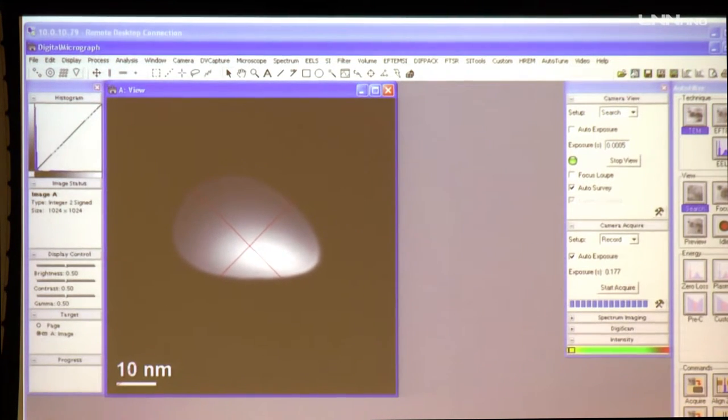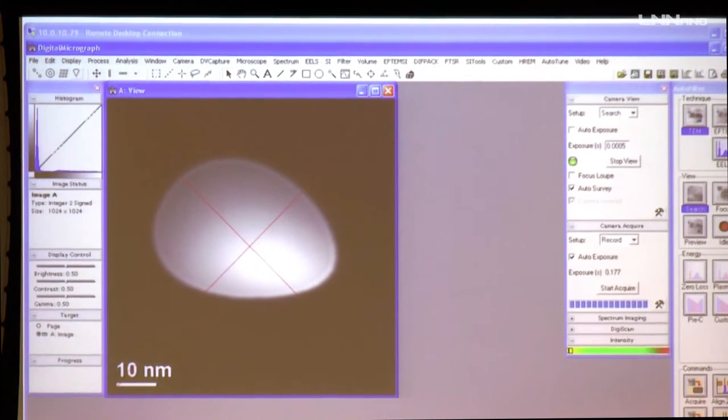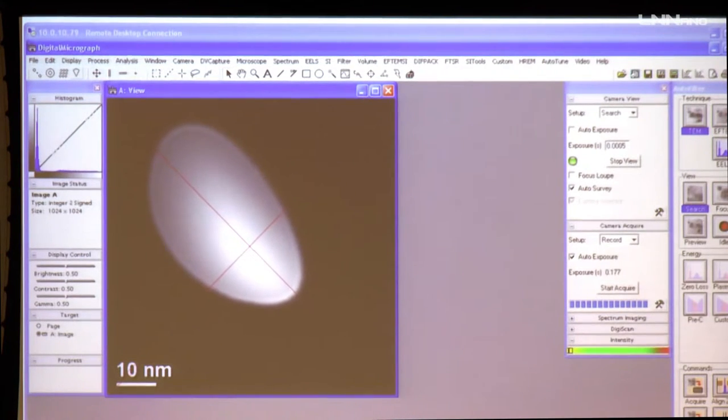So it's really very good. It's really a kind of equilateral triangle. I will try to show how an astigmatic beam looks by making it bad. So condenser stigmator. If the beam is something like that, it's highly astigmatic in nature. So we need to correct it.